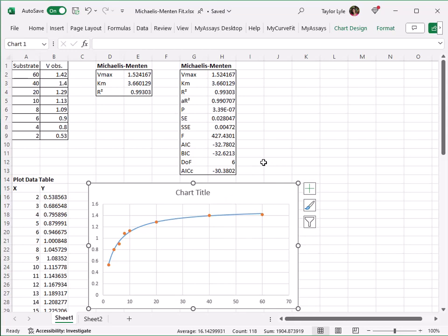With this in place, our calibrator data has been used to calculate the Vmax and Km values for the Michaelis-Menten fit, and the resulting curve has been plotted.